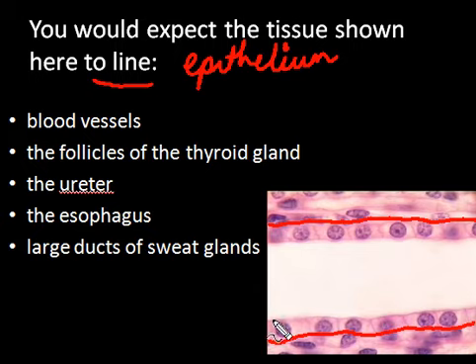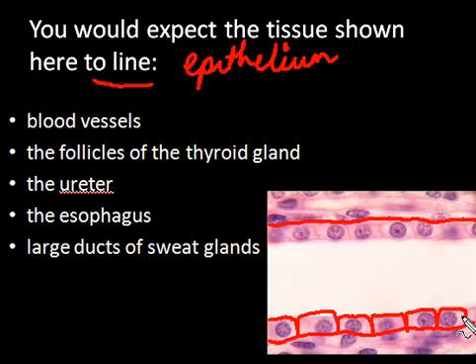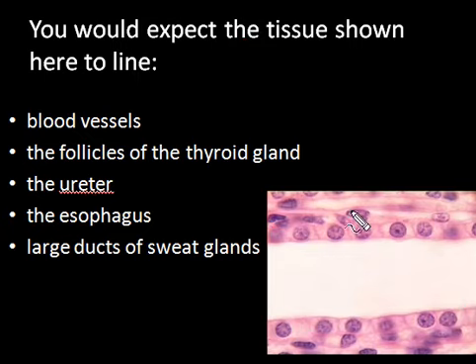So that's the basement membrane, and these are the cells. If you look at these cells, you can see that they are as tall as they are broad. Hence this is cuboidal epithelium. Some students often mistake this as stratified cuboidal, because they think that this is the second layer of nuclei up here. But if you look, there is no basement membrane. There's space here. The basement membrane very clearly is this one here. These are just nuclei of cells present in the connective tissue, as are these. So that's why this is cuboidal epithelium.